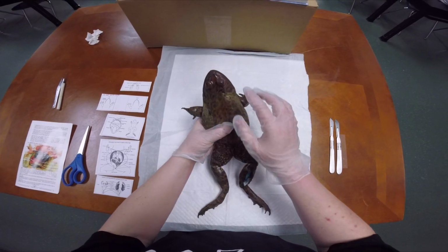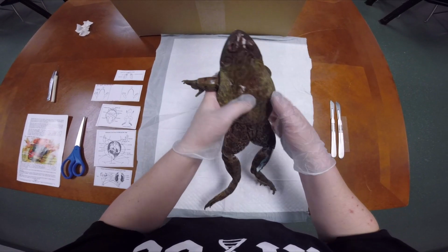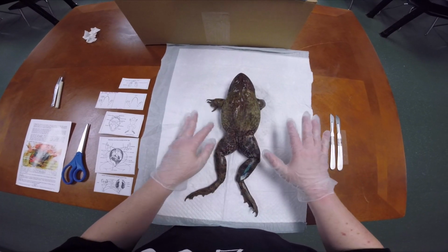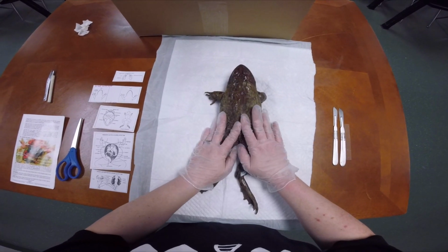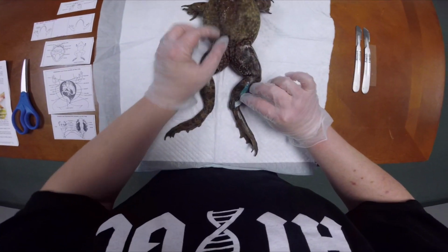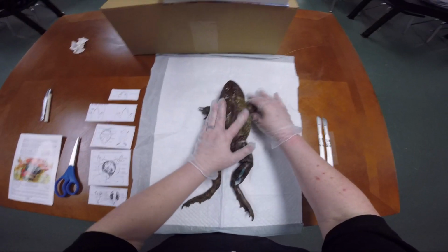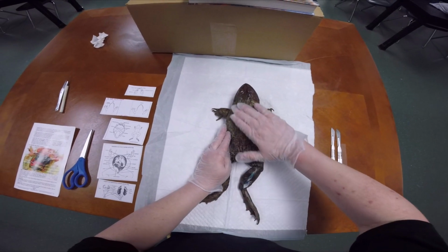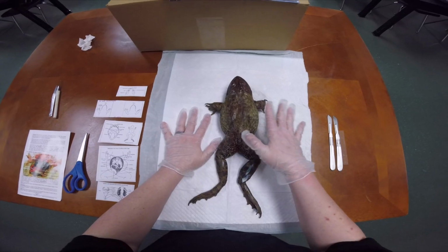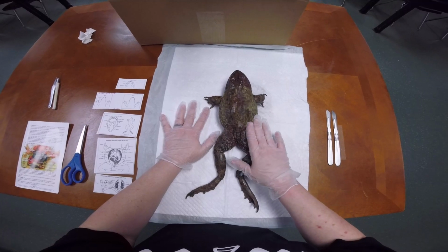But since they've been injected with dye and they've been sitting for a little bit, you can see that red here and here. They wouldn't look like that in nature. They would have that more green and brown color to help them be camouflaged. So anyway, just notice the red and the blue and how that's not what it's going to look like if you were to go catch one out in a pond. So anyway, just want to let you know about that. And the dye that they inject, and that helps us to see, once we get inside, that dye will help us to see some of the things that normally we wouldn't be able to see.